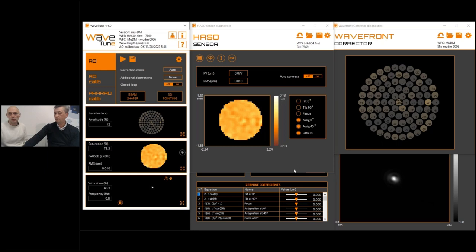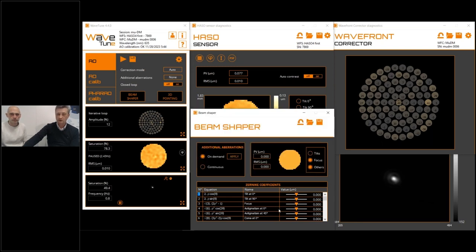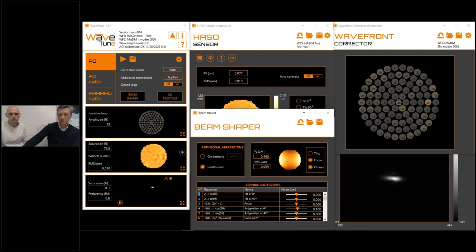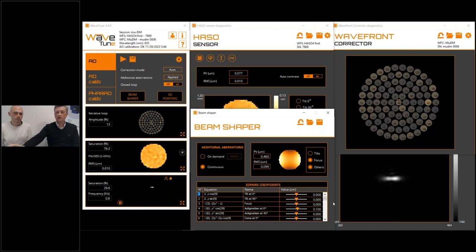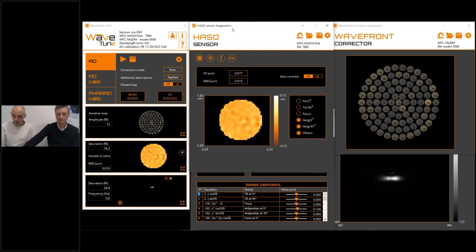For beam shaping, the astigmatism shown earlier is a good example for applications like single-molecule imaging. You can also slowly change the focus, and see the symmetry of astigmatism that can be achieved using this approach. We've now covered most of the capabilities of the mirror. This webinar is now open for any questions you might have in the chat section.